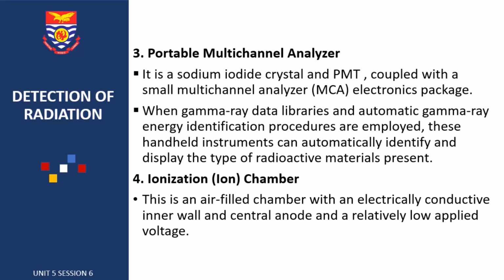Another instrument for detection of radiations is the portable multi-channel analyzer. It is a sodium iodide crystal and PMT coupled with a small multi-channel analyzer electronic package.